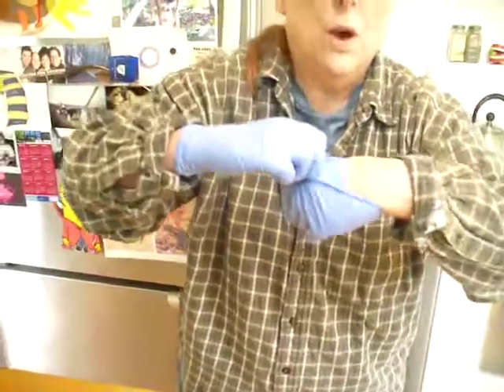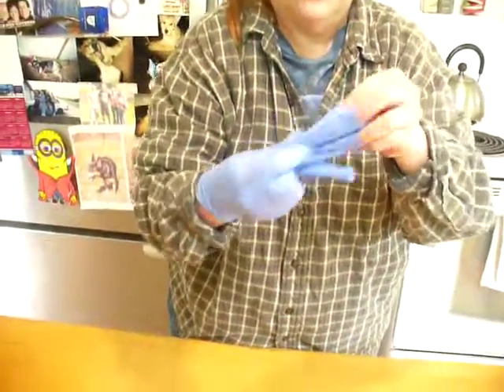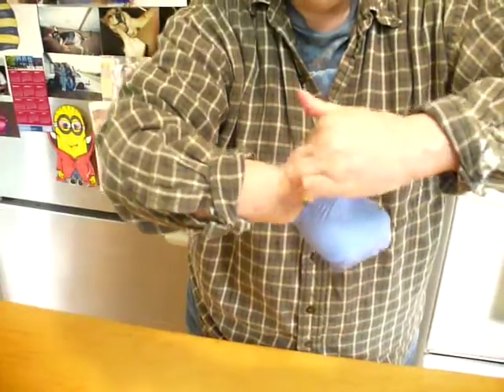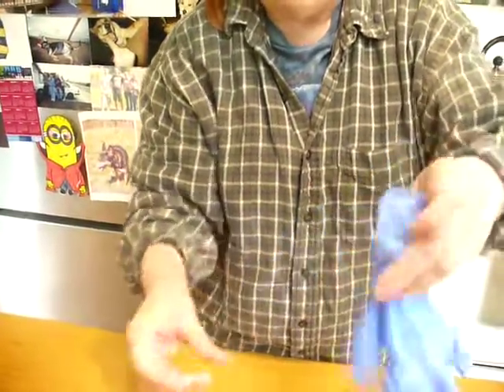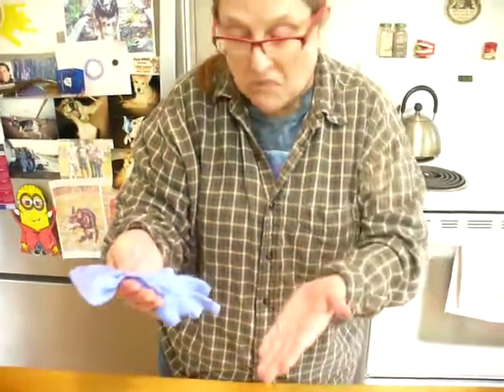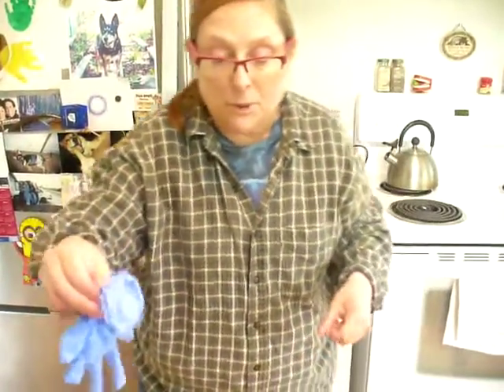I'm going to pull this glove off inside out and ball it up in this hand. Then I'm going to grab this one and do the same thing, but with the first glove inside it. I've made a nice little package with anything that is a contaminant or could cause any problems — everything's inside, so it won't cause any problems for the custodians.